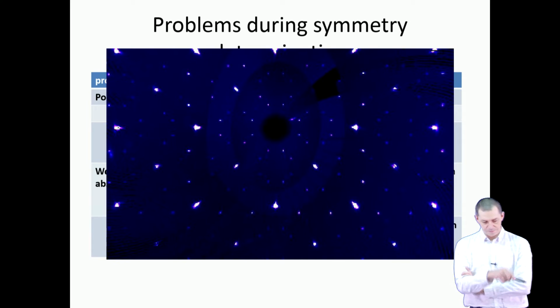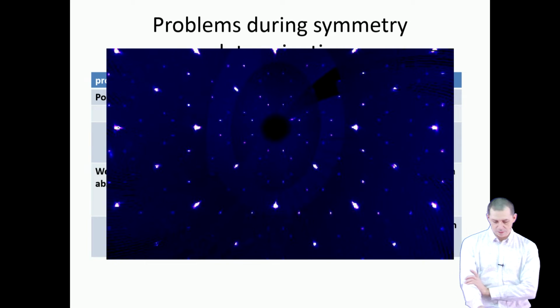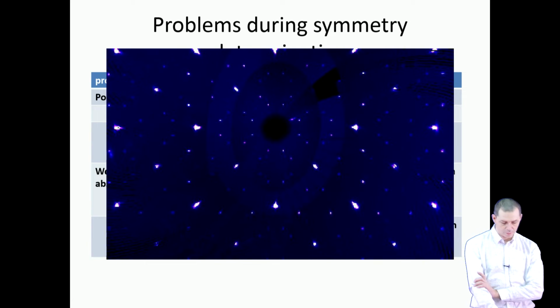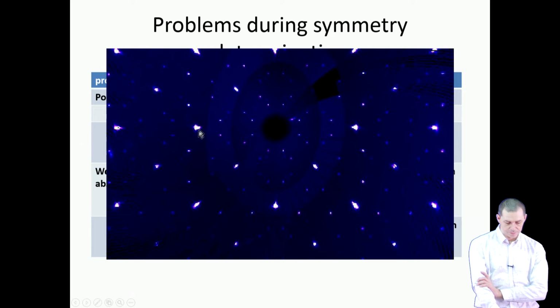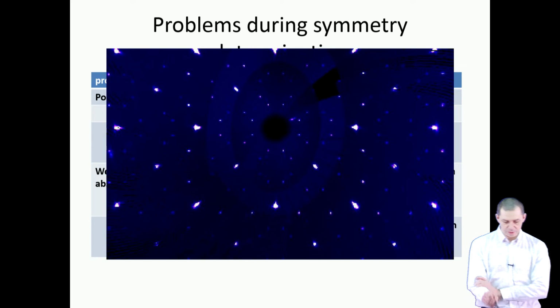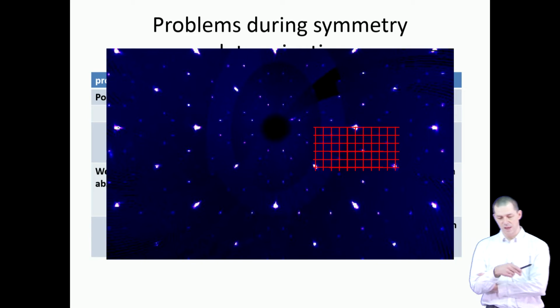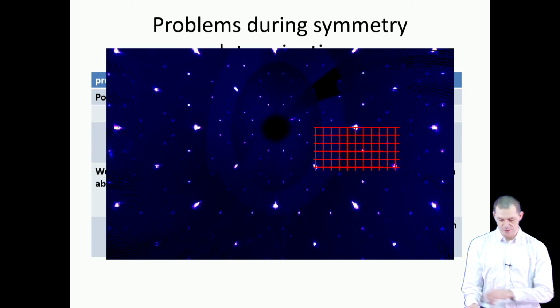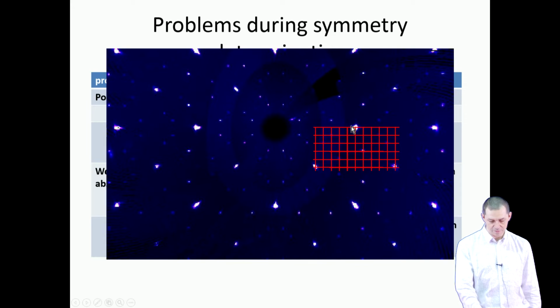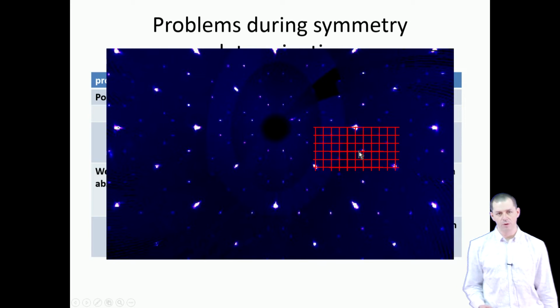This is a section through the diffraction pattern. You see many strong spots. They actually form a parent tetragonal unit cell like this. But if you want to describe also the weak spots on the same lattice, you need a lattice that is as small as this in reciprocal space. So it's actually a 5 times 5 fold lattice, and then all these weak spots like this one fall in the nodes of the lattice.